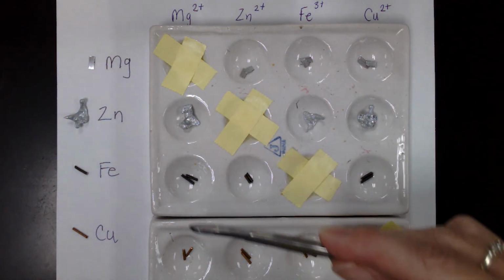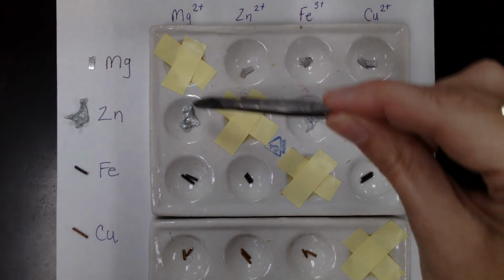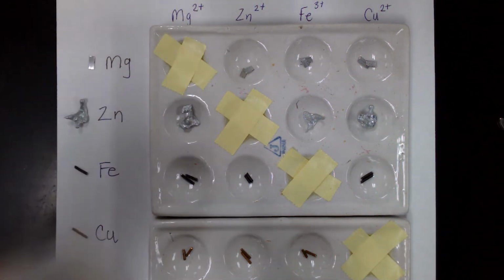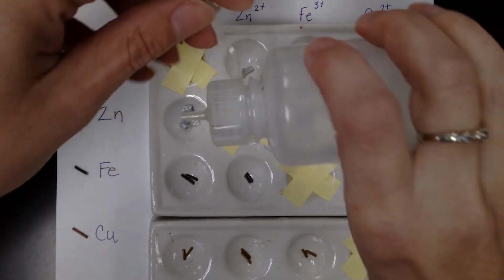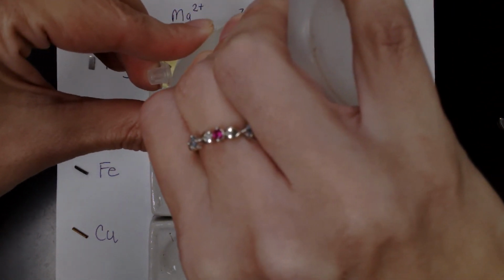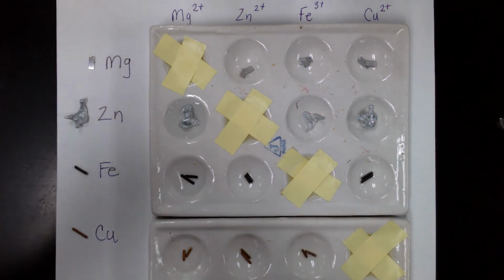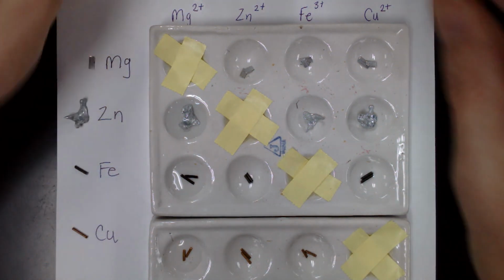Okay, so then for our columns, this is going to be our solution of metal. So in these wells, we're going to put the solution of magnesium nitrate. So we have our magnesium nitrate. That's going to go in our wells here. So we'll fill it, we cover up the metal. Okay, so we have our first column now with our magnesium nitrate solution.